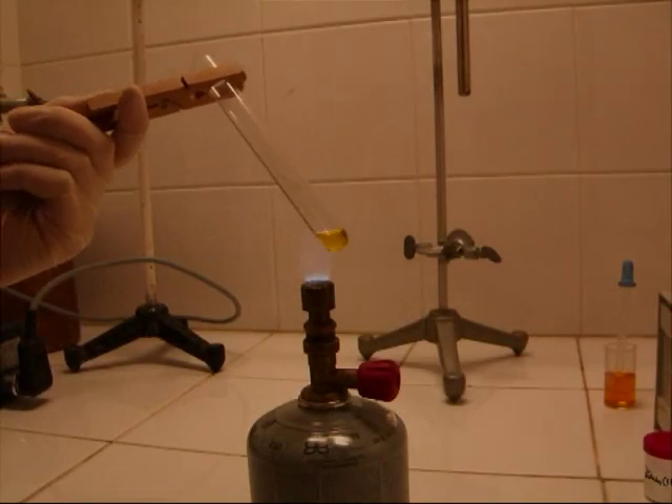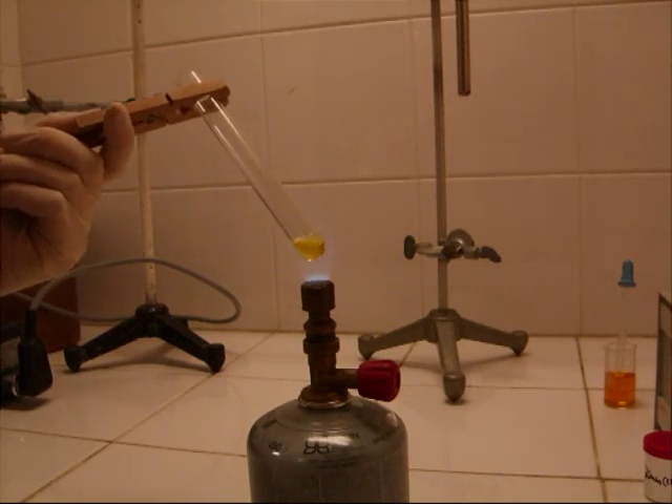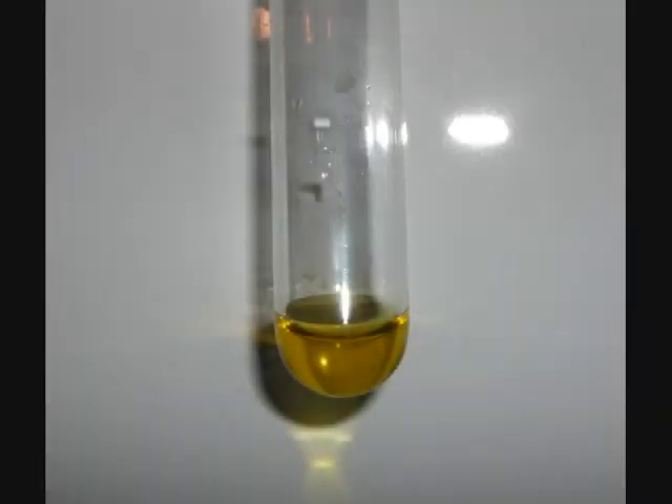In the end, I am purifying the chloroauric acid by boiling it with hydrochloric acid. This gives a pure chloroauric acid solution.